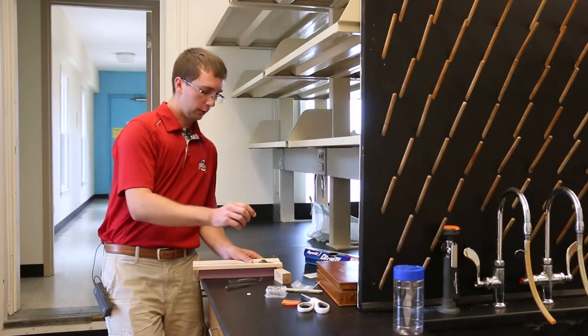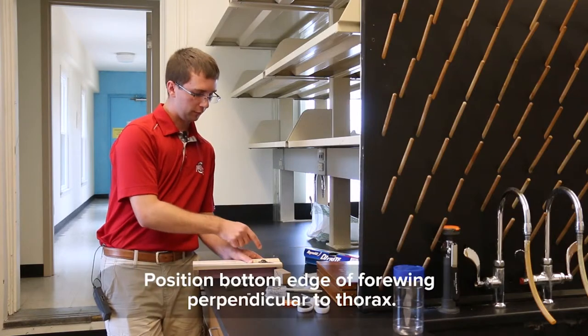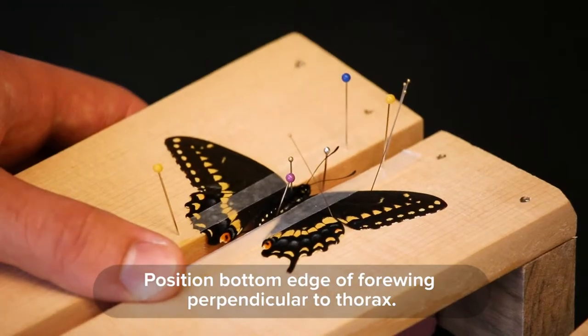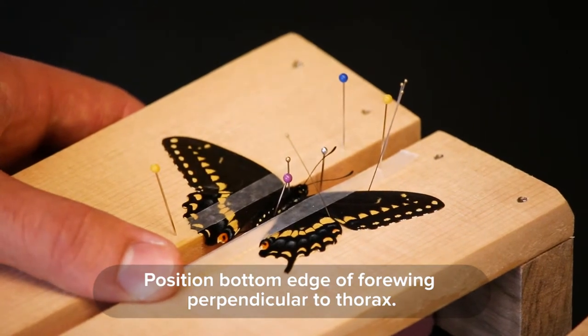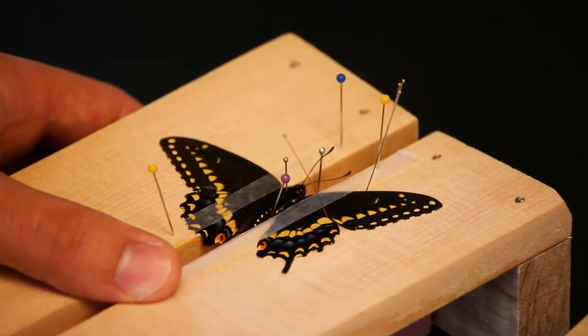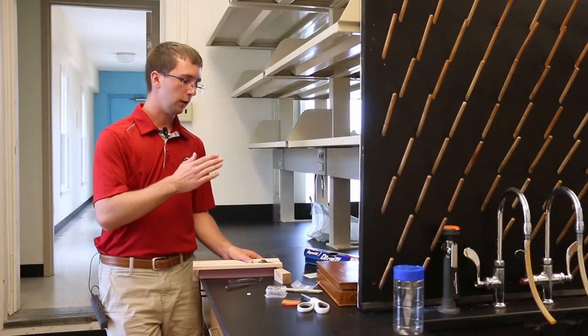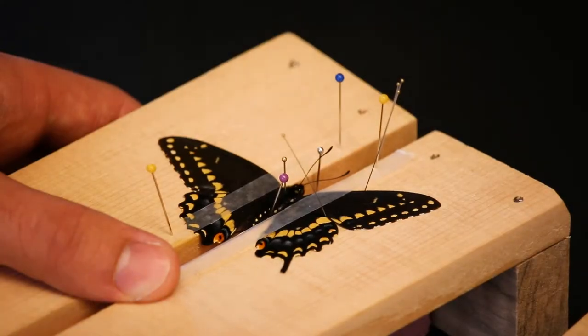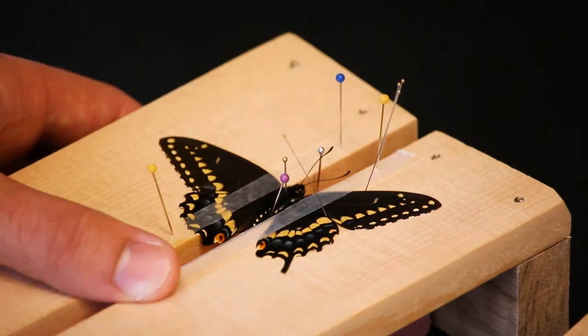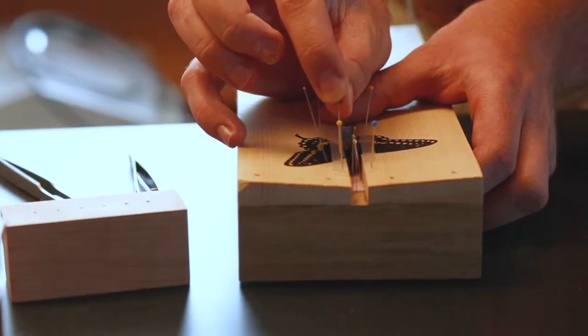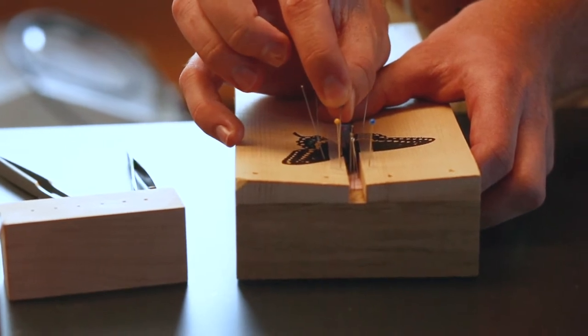When I spread my specimens I typically take the bottom edge of the forewing and make it perpendicular to the thorax, to where the thorax center line would be. That's a standard way of doing things. It gets the wing up high enough to where you can see all of the hind wing and all the forewing, and it looks good when you have a completed product. I'm going to pin the wax paper so they hold the wings in place.